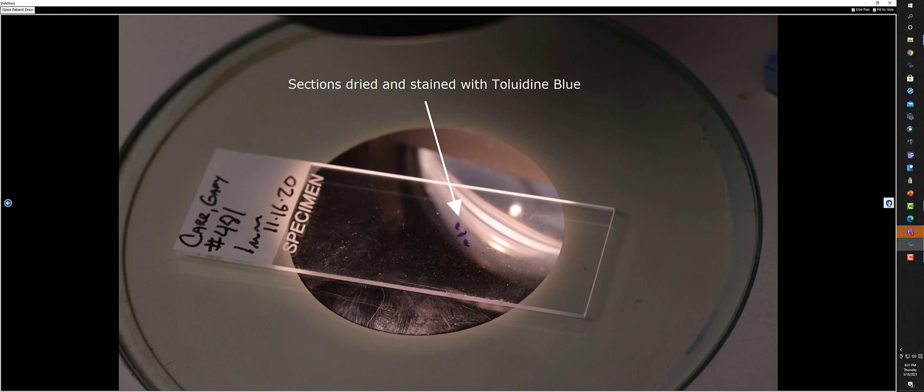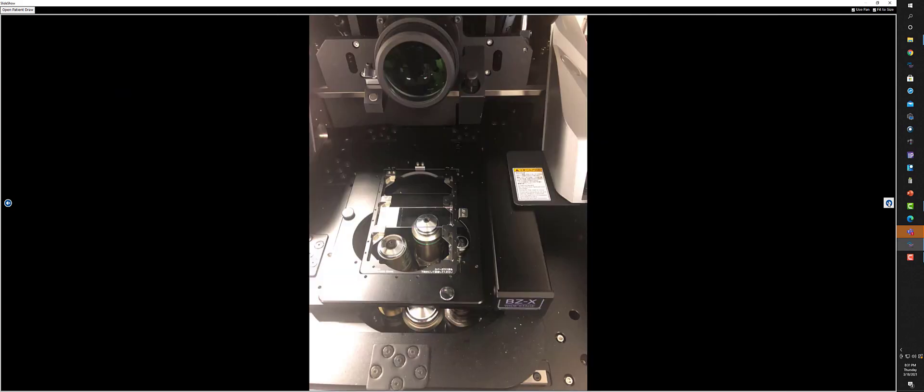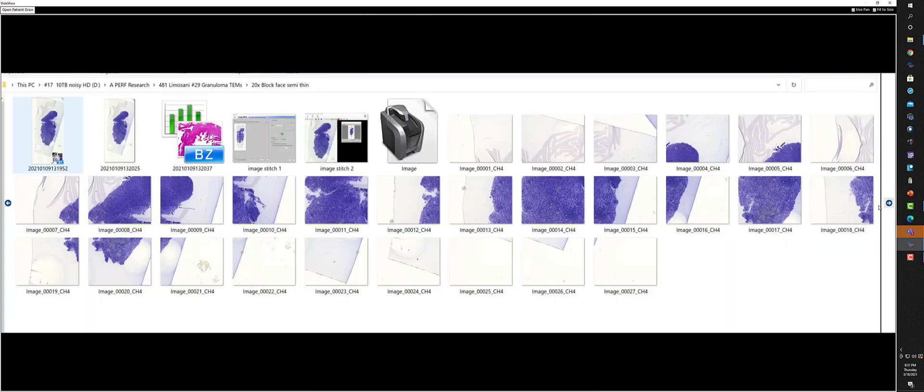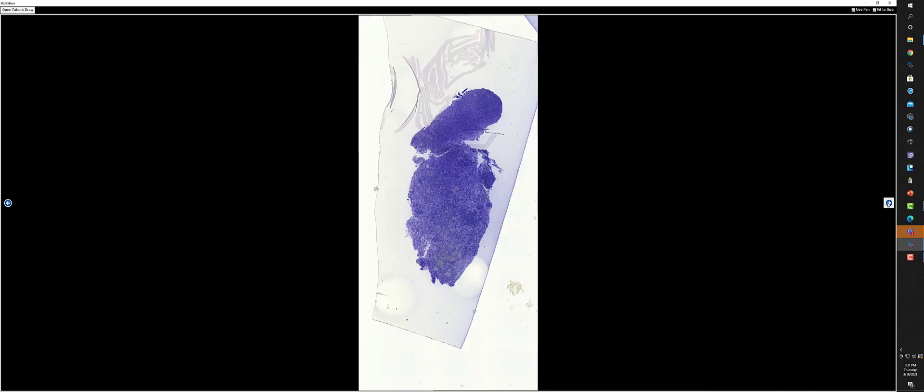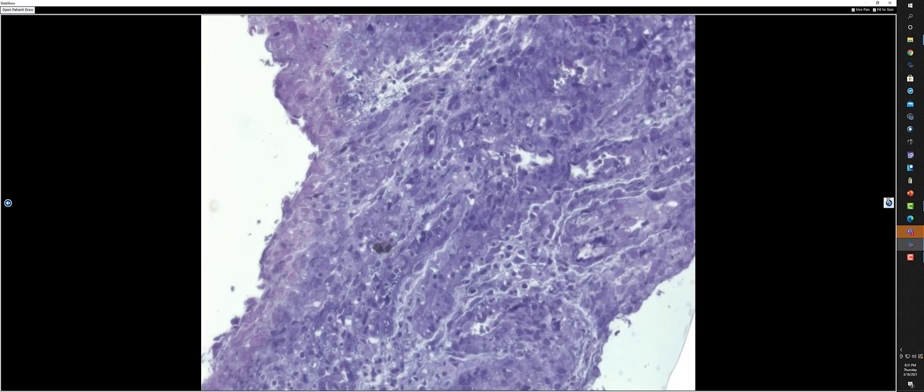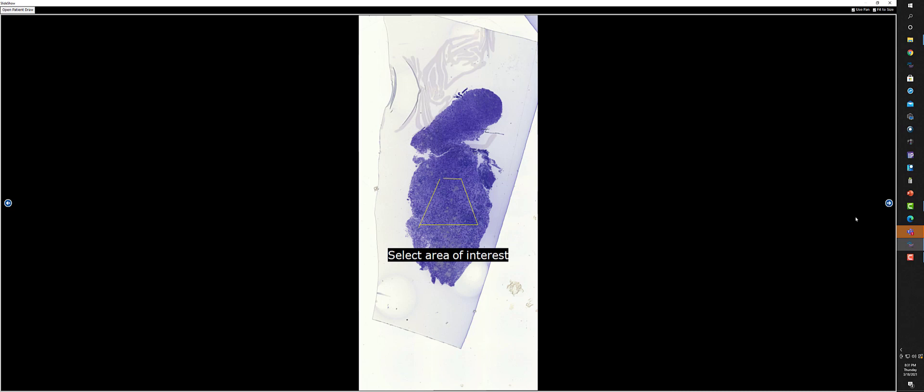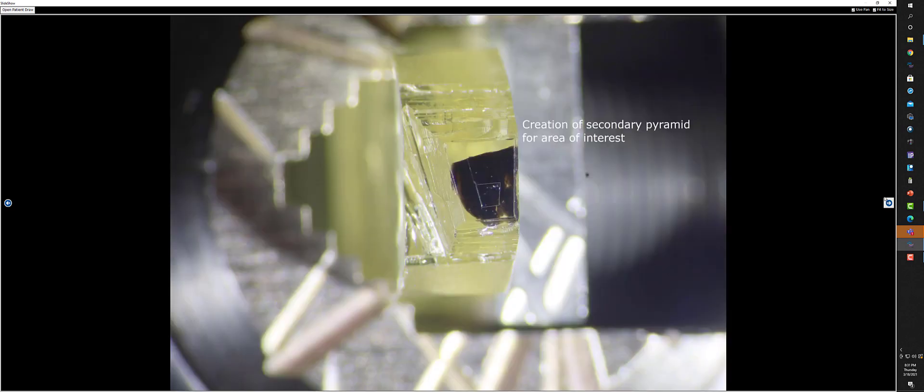I put these in our Keyence unit, which does the scanning, high-resolution scanning automatically. It takes these very high-resolution scans and stitches them together. You end up with a final picture that's very high-resolution. I can go in and look at any area at very high magnification. Now I need to select the area of interest in the semi-thin section, and then I need to make my pyramid within that section.